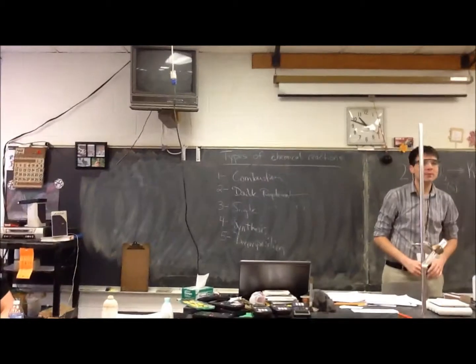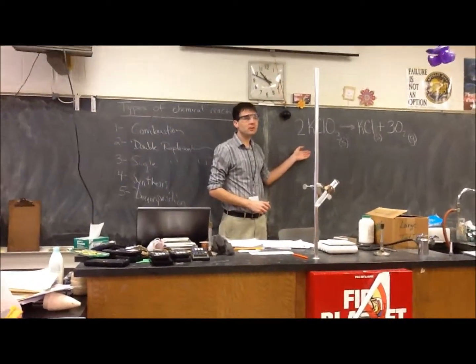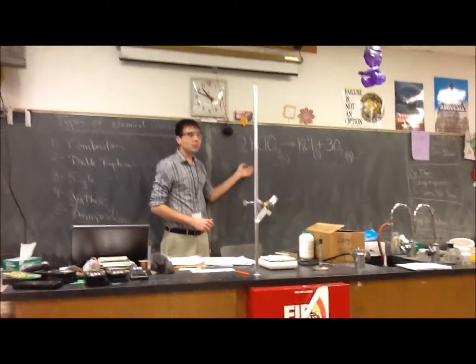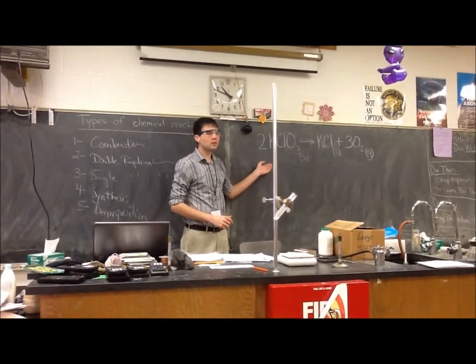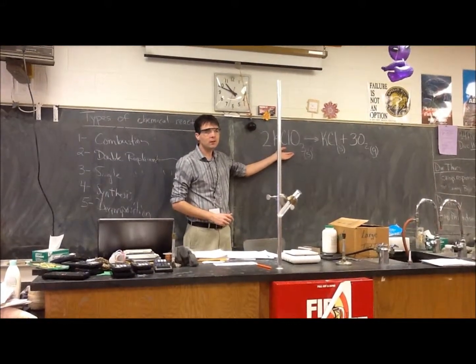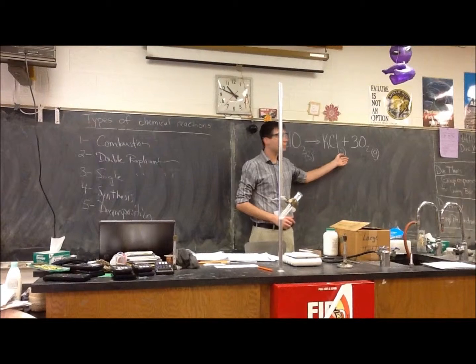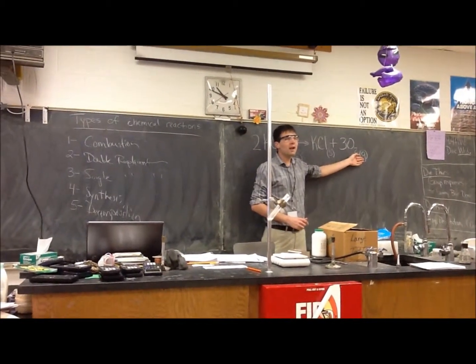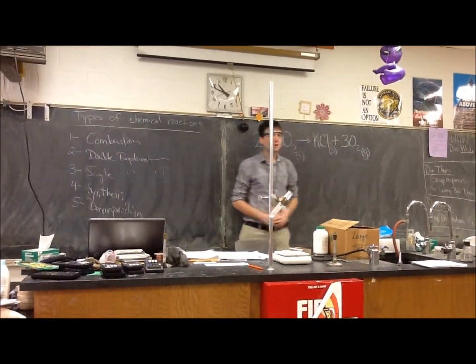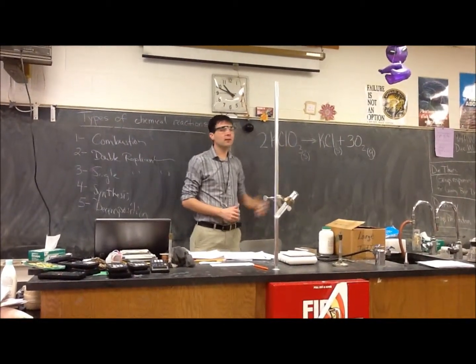Alright, so chemical reaction number one is a decomposition reaction. Here's the chemical equation. Make sure you get that recorded. Potassium chlorate, KClO3, decomposes to potassium chloride and oxygen gas. All that I have to do is add heat, and it does that.